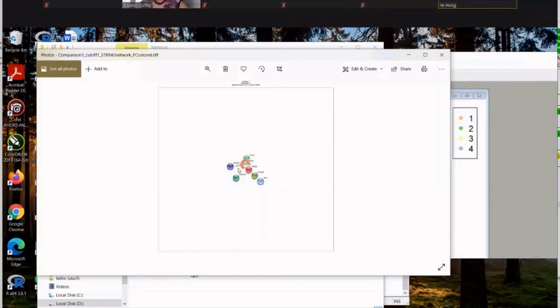It's everything above 0.4 in confidence level, which is also the default confidence level for the STRING database. STRING defines high confidence to be a confidence level of over 0.7. I also have that for my kinase information, but I don't have it on here. So every interaction that shows up has a confidence level of 0.4 or higher. The confidence level goes from 0 to 1.